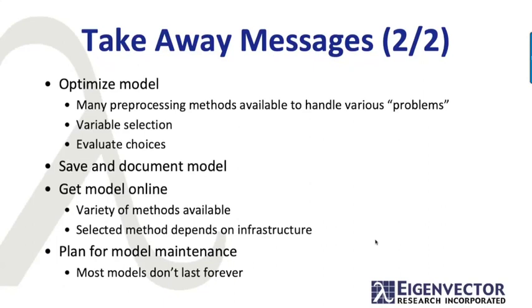So one of my suggestions is use the plot preprocessed data function and look at it and see what it looks like. And I really suggest that if you have a number of pre-processing methods that you're going to use together, look at your data after you've applied the first one, then the second one, then the third one as you add them.